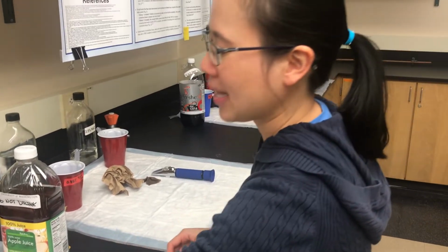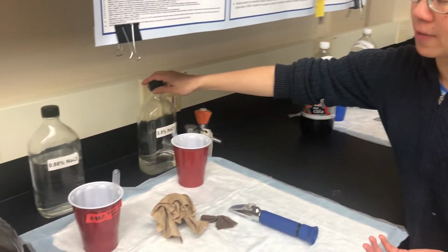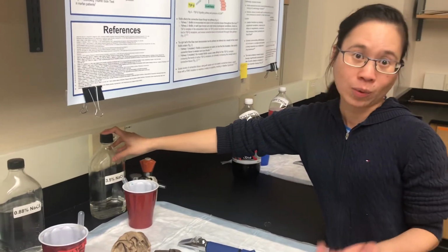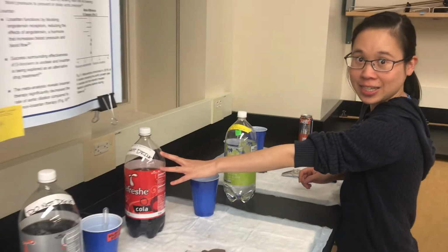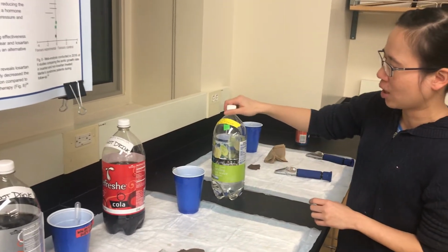All right, so that's that. So see if you can predict, based on that information, what the specific gravity should be for a 3.5% sodium chloride solution, which is kind of like seawater. And then we also have cola, which has caffeine, and is a diuretic, if you remember, and should not be a particularly great hydration option.